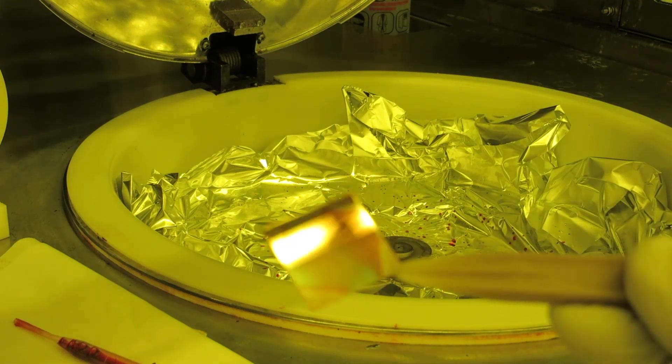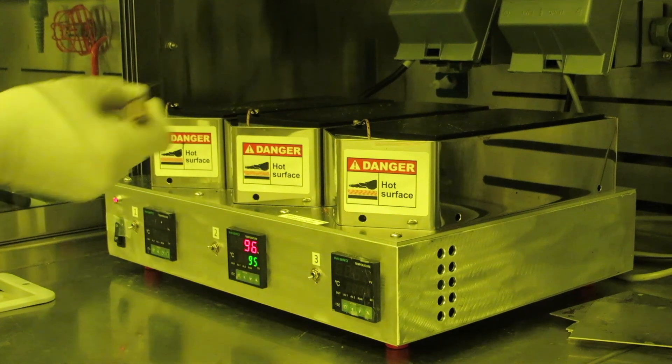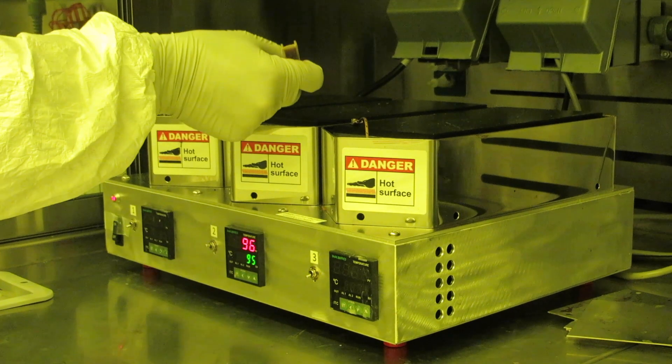For normal resist, you can put the sample directly on the black surface of the hot plate. For other materials like SU8, you would want to use the little sheet metal aluminum trays which are sitting to the right of the hot plate.